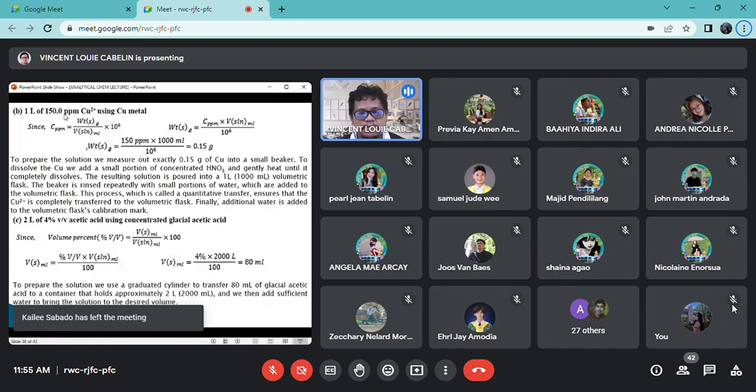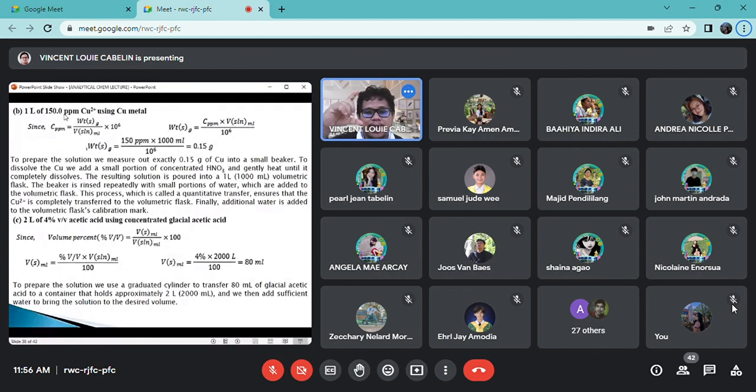Okay? So, when you say volumetric flask, it is a flask that has a calibration mark. So you are already guided how much volume of water or whatever solvent that you need. You are being guided how much you have to add to reach that particular volume.